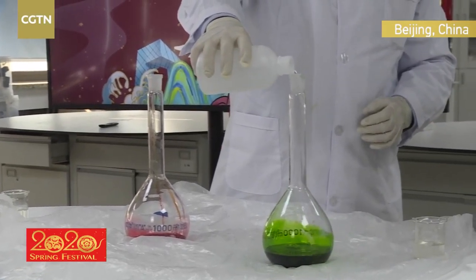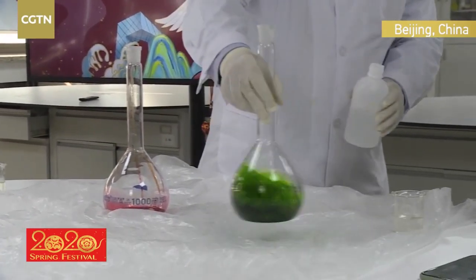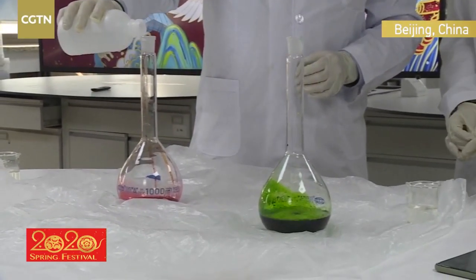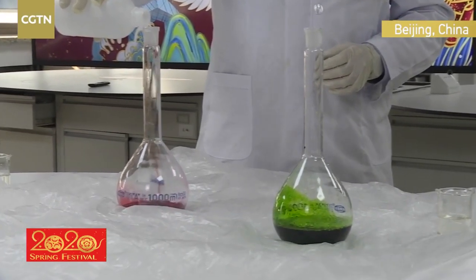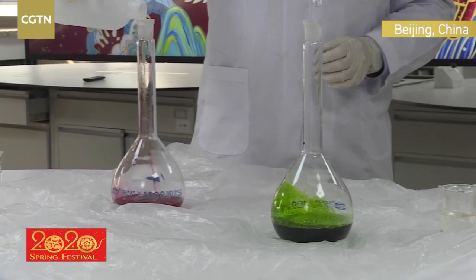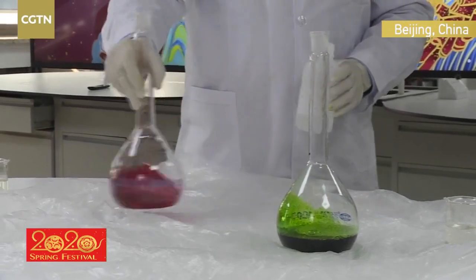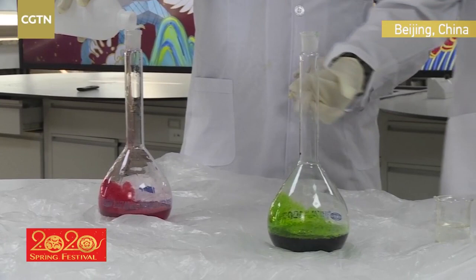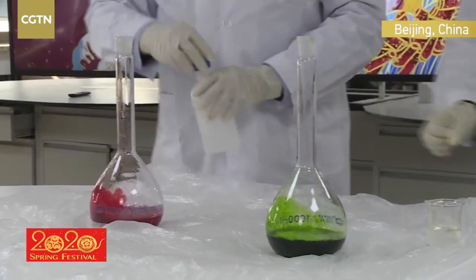So, no. We found that to make the Aladdin's genie, the hydrogen peroxide needed a catalyst to make it break down quickly into oxygen and steam. The washing up liquid is obviously not a good catalyst because it's not breaking down. So what we're going to do is speed up the process again. How do we speed it up? What we do is add a different catalyst. We don't add the black powder manganese dioxide this time.